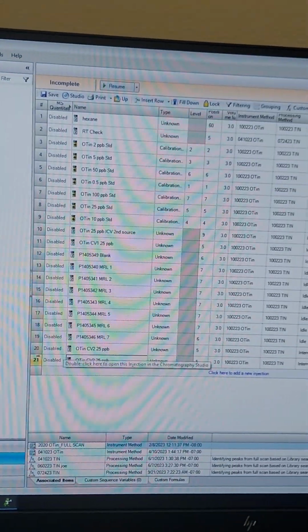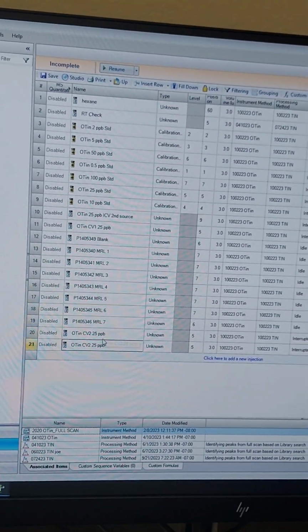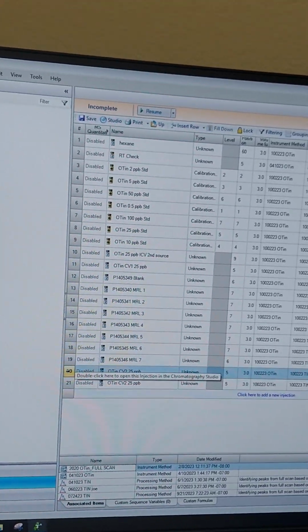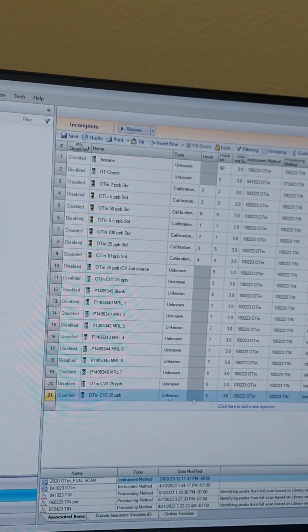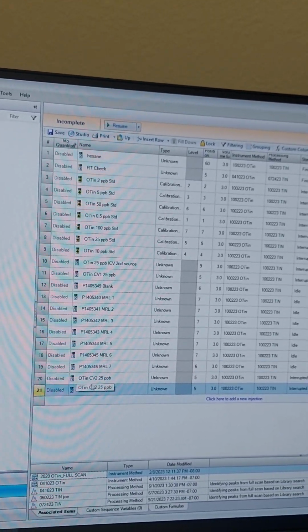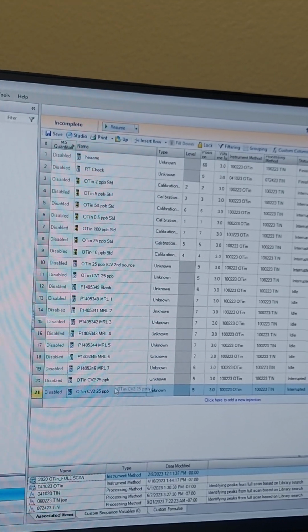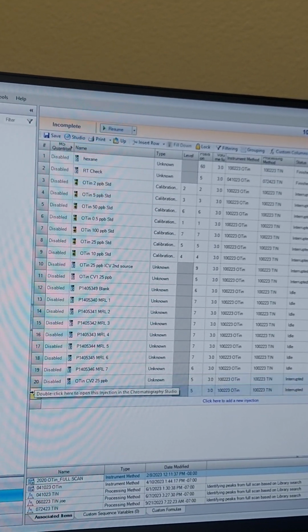The reason we do two is because we need a passing one at the end. Corroborate one is best. Yeah. Okay. So it's because we won't be here when this finishes, so it's best to have two just in case.